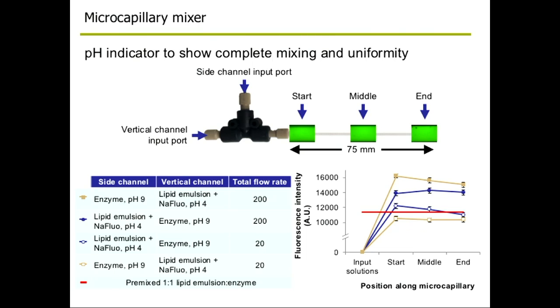We had a collaborator in Sydney who uses some of these tee mixing systems to look at mixing processes. When Linda ran this at the really slow flow rates that we're interested in, we found that she can actually get the fluorescence of a mixed system to match what we'd expect from the pre-mixed components by the end of, or at least almost right through, this microcapillary mixer. So at least in terms of making some progress for the project, she flipped over to that type of system.